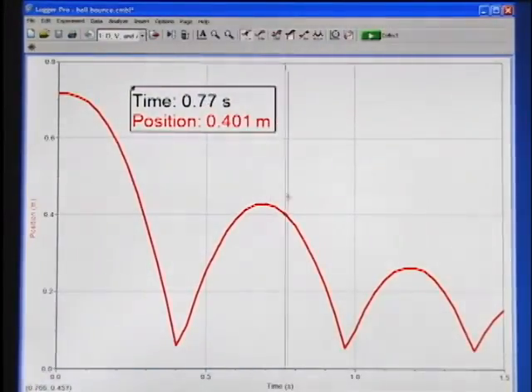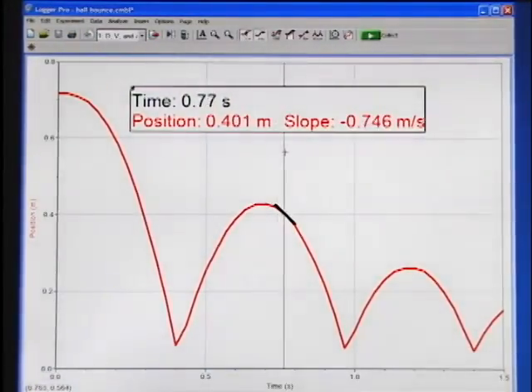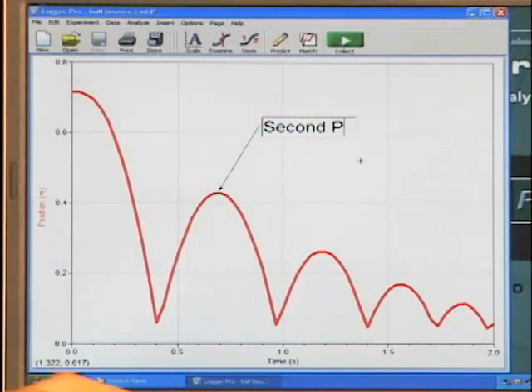Students can superimpose cursors, add tangent lines, and do interpolations. Graphs can be annotated with text comments, allowing students to really tell a story with their graphs.